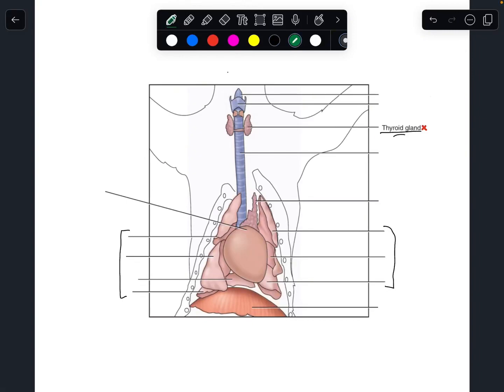Today I'm gonna go over the full dissection of cats. And at the end of the video, I'm gonna go over the arteries. And so yeah, let's just get into it.